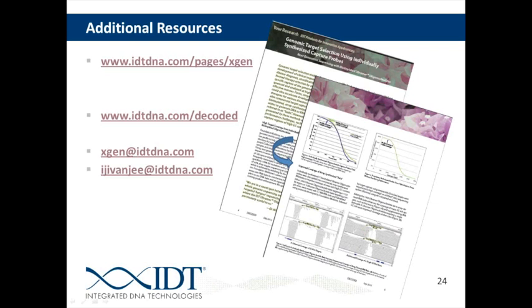Adam, you can correct me if I'm wrong, but I think there are databases available, particularly the 1000 Genomes Project, which provides annotated information on where sequences have been covered and not been covered. However, the different capture sets that come out have different versions as well, so I strongly suggest doing a sequencing run first before trying to supplement for it. The pattern has traditionally been that high GC content regions are not captured very well.